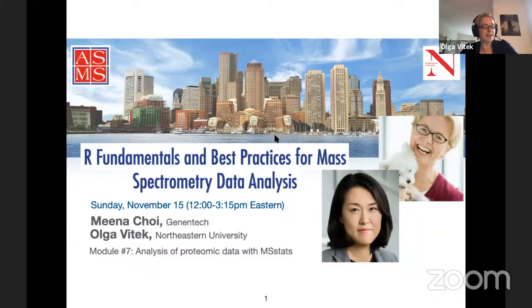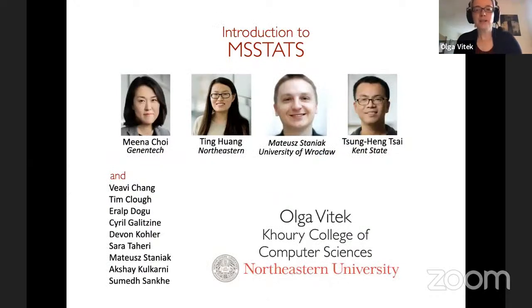Okay, so just as yesterday, what we will do for the MSstats part is in 2 parts. Very briefly, I will give a crash course on MSstats and introduce the concepts behind it. Then Meena will be doing the examples, a live demo, and then there will be a portion for you to try it out if you're interested. Let me start with that.